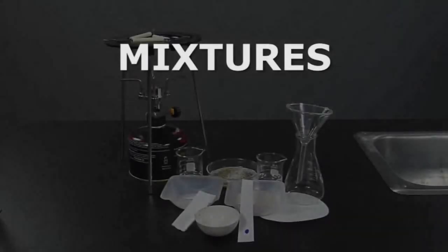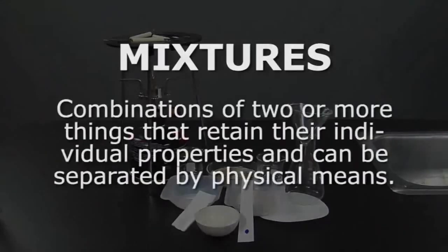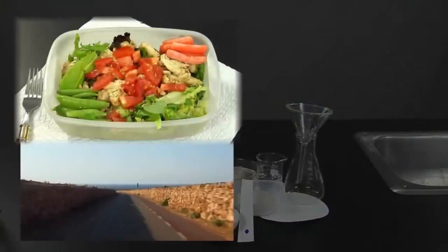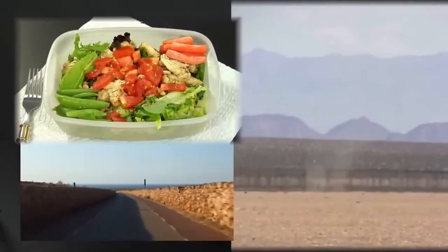Today we will demonstrate the different methods that can be used to separate mixtures. As you recall, mixtures are combinations of two or more things that retain their individual properties and can be separated by physical means. Some examples of mixtures are salads, dirt on the road, and even air.